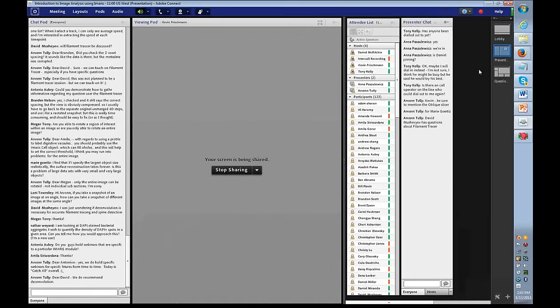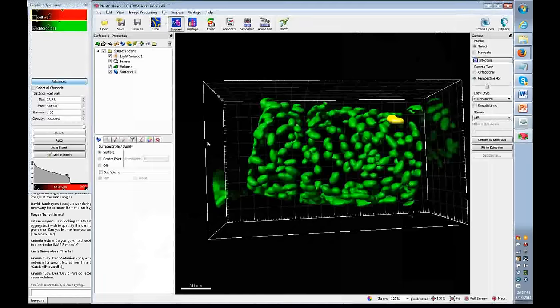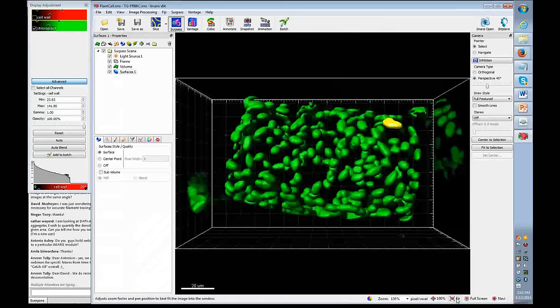All right. Actually, if you want to take a look at, Lonnie had a question about showing snapshots of an image at an angle. Do you want to show them the MATLAB camera manager? I don't know. Yeah, or shall I do that? So if you want a specific angle for a snapshot, it sounds like that is the question.